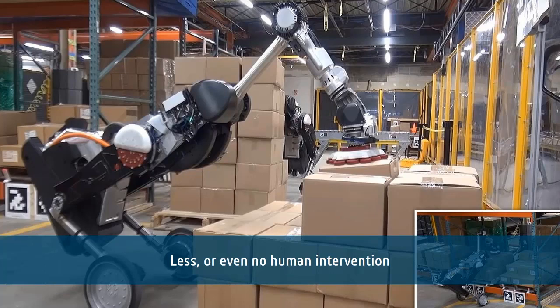In design mode, you can use the automatic invalidation that gives you a first automatic invalidation, and you can continue invalidating or modifying the data as before, and you will have a trace of which wells have been invalidated automatically, and which wells have been invalidated or revalidated manually, and by whom. So in the end, Autopilot gives you the possibility to have no human intervention, or to have less human intervention in some cases where the complete automation is not required or desired.